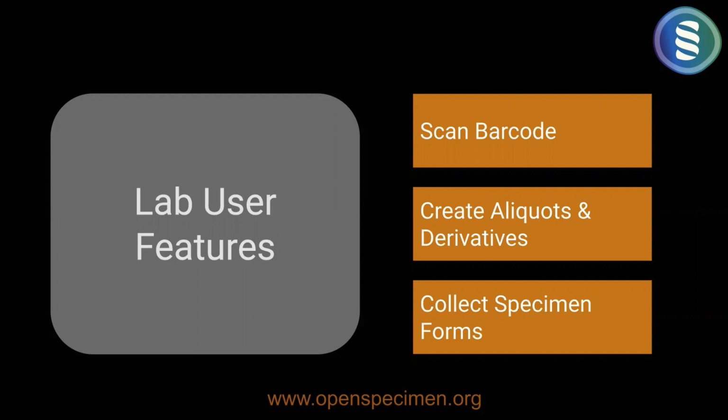The specimens come to the lab, and then the lab users themselves do the patient registration, consent collection, or form collection. So that can still be done. It's all based on your roles and privileges. Just in terms of explaining the workflows, we are just differentiating between the two users. It does not mean that the lab user cannot enter participants, or that there is any restriction as such. It is just a way of explaining all the use cases.